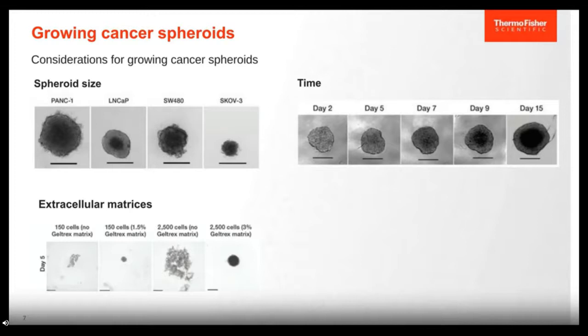Some cell lines form spheroids on their own, while others will form loose or tight aggregates, requiring assistance from materials such as an extracellular matrix to help with spheroid formation. The ECM assists with the cell-to-cell contacts needed for cells to aggregate into a compact spheroid. In the image here, the PC3 cell line requires a little bit of GELTREX to facilitate spheroid formation. In the absence of this matrix, the cells gather together but don't form a compact spheroid, whereas in the presence of GELTREX at differing amounts, you see improvement in spheroid formation.